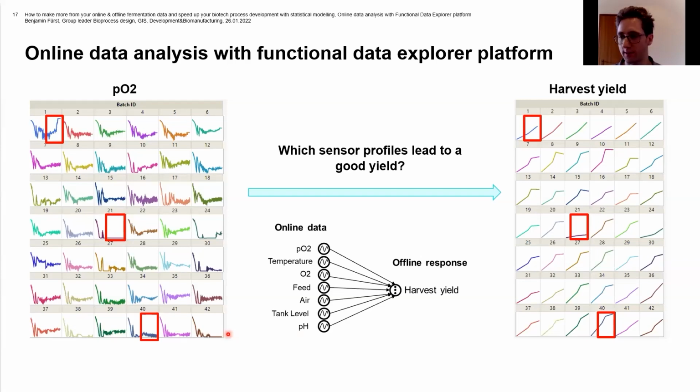Before we start, I wanted to put that graphically again. On this side, we have all the PO2, the graph I already showed you before. That's the PO2 over all the batches. And you can see that in the end here, this one's going up, the PO2 sensor. Here, the PO2 is very low. And here it's somewhere in the upper, lower region of the sensor.